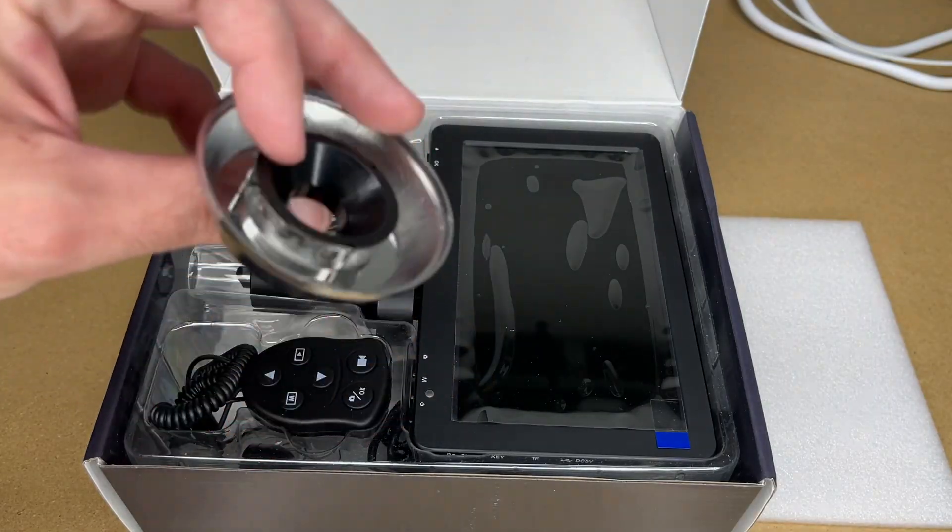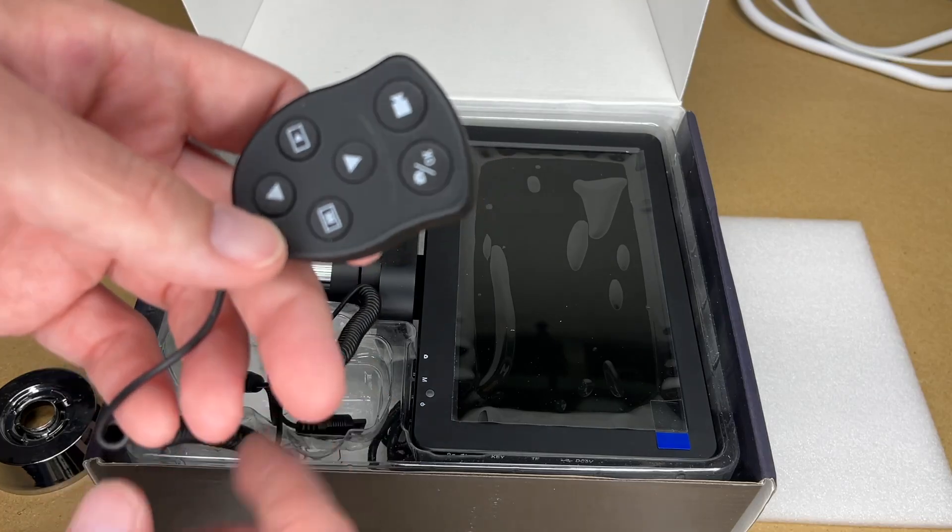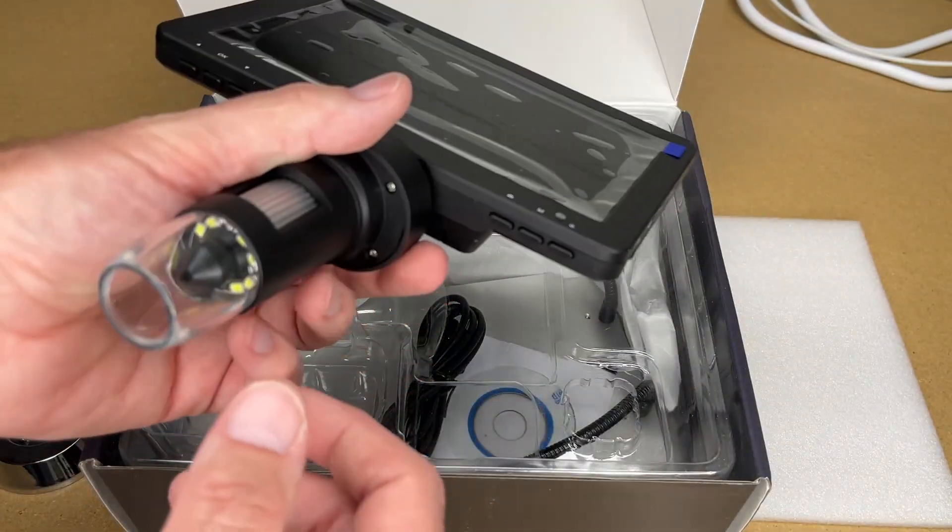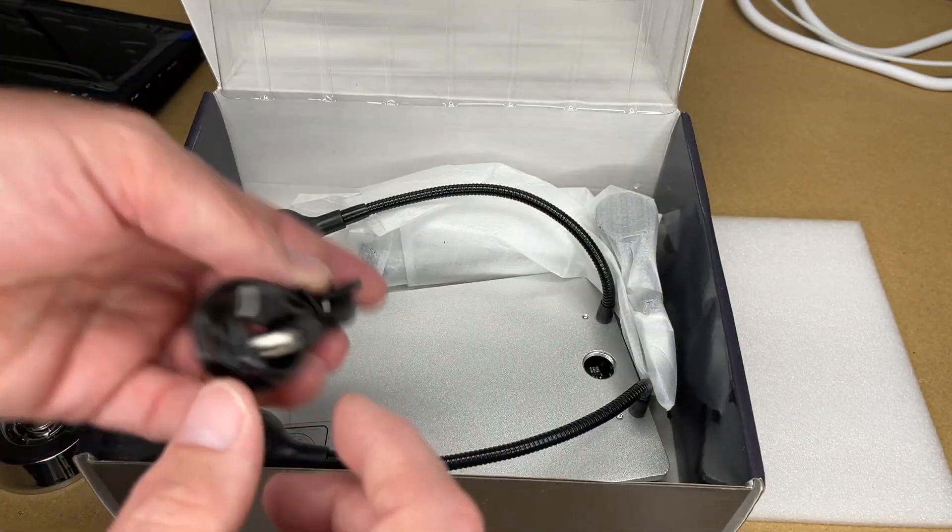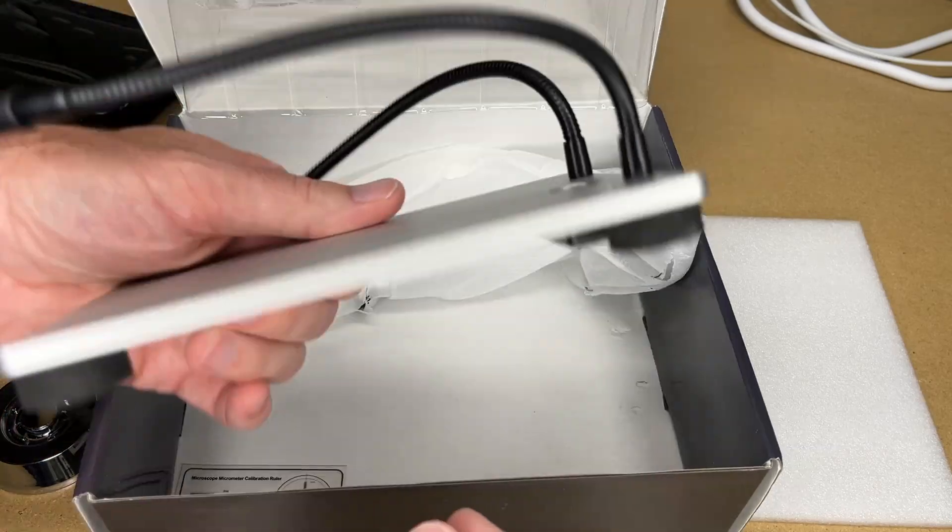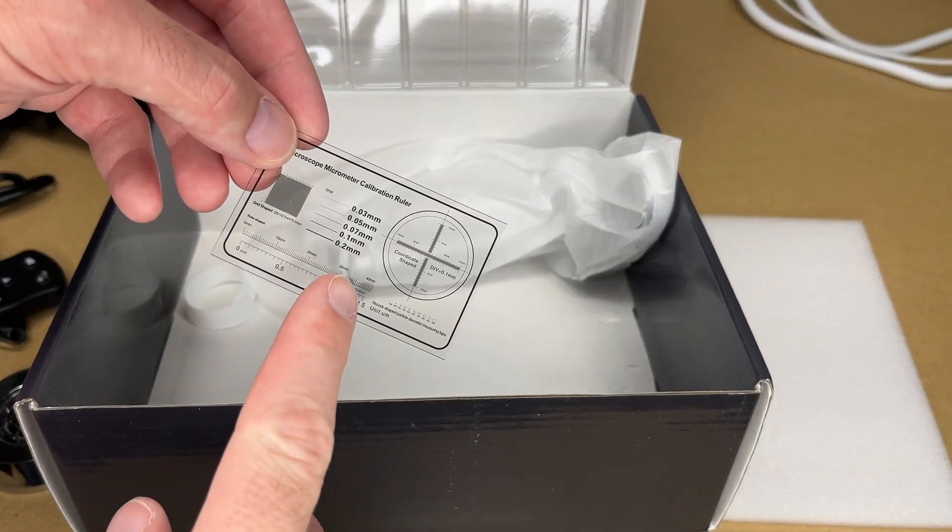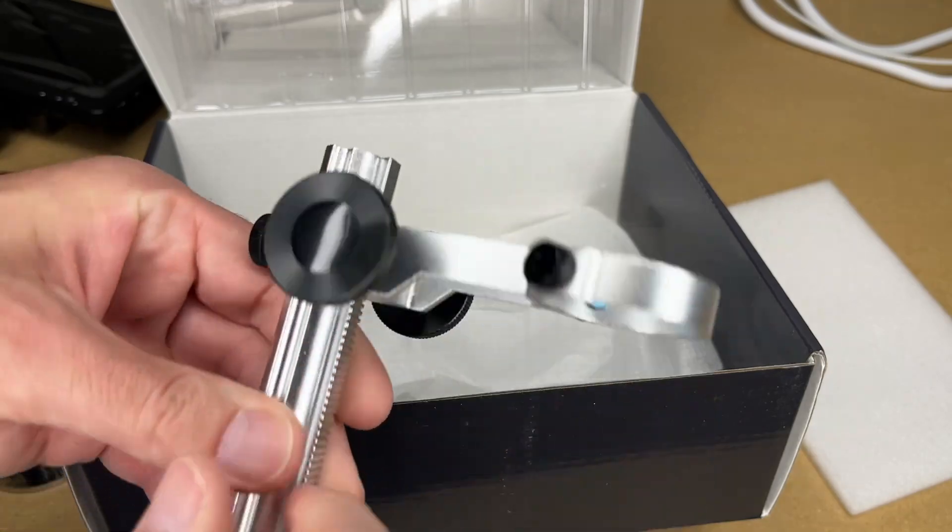So here's a part. I don't know if that's a base. Here's the remote and it has a cord on it. So here's the microscope and the screen. CD-ROM. Micro USB cord is the base. It appears to be made out of aluminum.